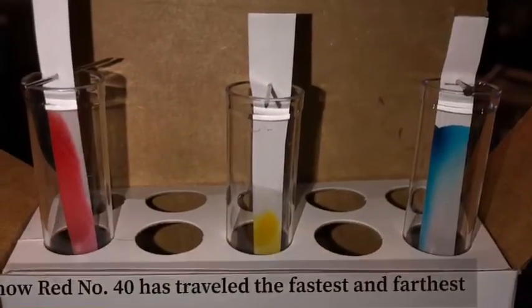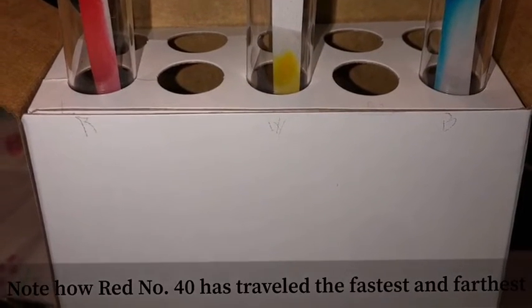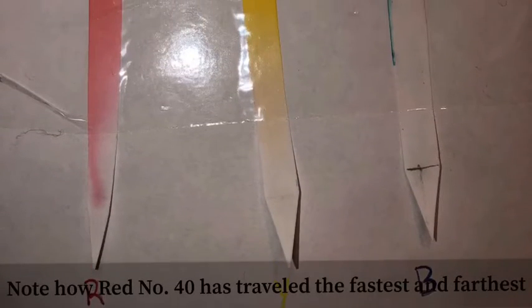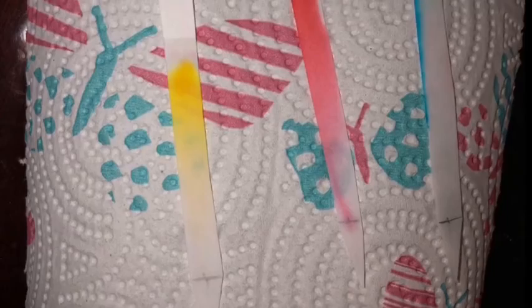Based on these results, red number 40 had the farthest travel distance than yellow number 5 and blue number 1. This shows that red number 40 is the most soluble, where yellow number 5 is the least soluble. These observations clarify that red number 40 is the most polar than blue number 1 and yellow number 5.